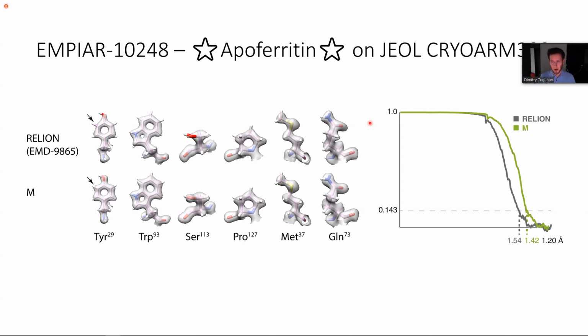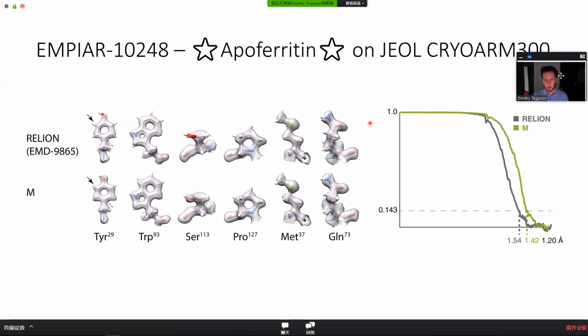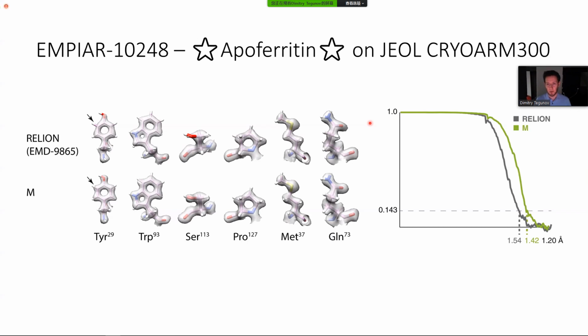Now, I don't mean to imply that this is a resolution range that will be relevant for most biological projects, but this is just to show that you can expect at least the same resolution, even in the highest resolution range, as you currently can from RELION.